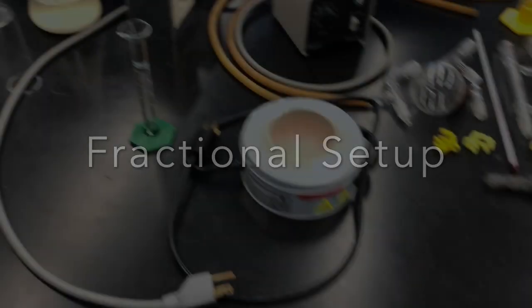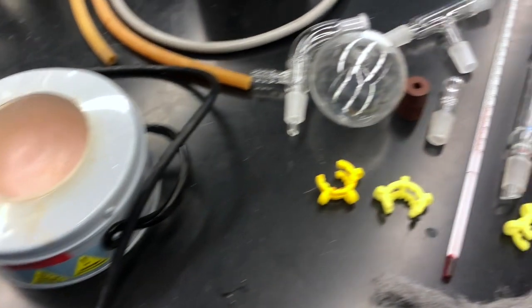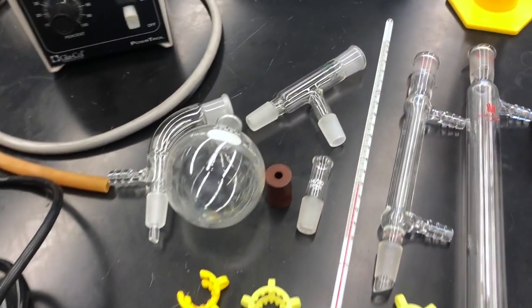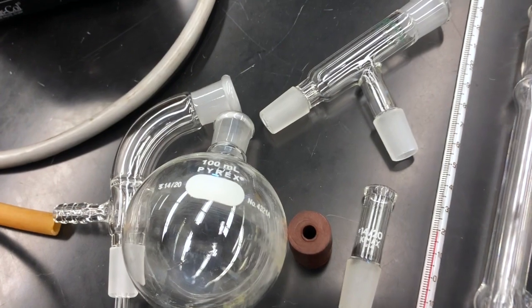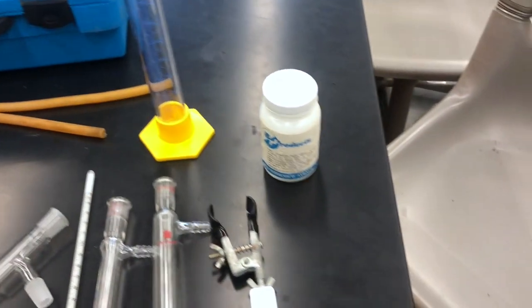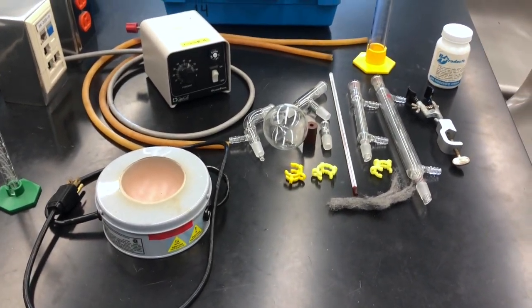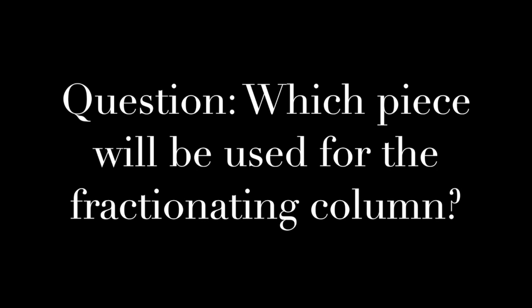We first set up our apparatus for fractional distillation, which will be slightly more complicated than simple distillation. We have our smaller ceramic heating device, voltage regulator, a 100 milliliter round bottom flask, distillation head, vacuum adapter, two condensers, thermometer, clips, thermometer adapter, clamp, steel wool packing for the fractionating column, and boiling chips for the boiling flask.